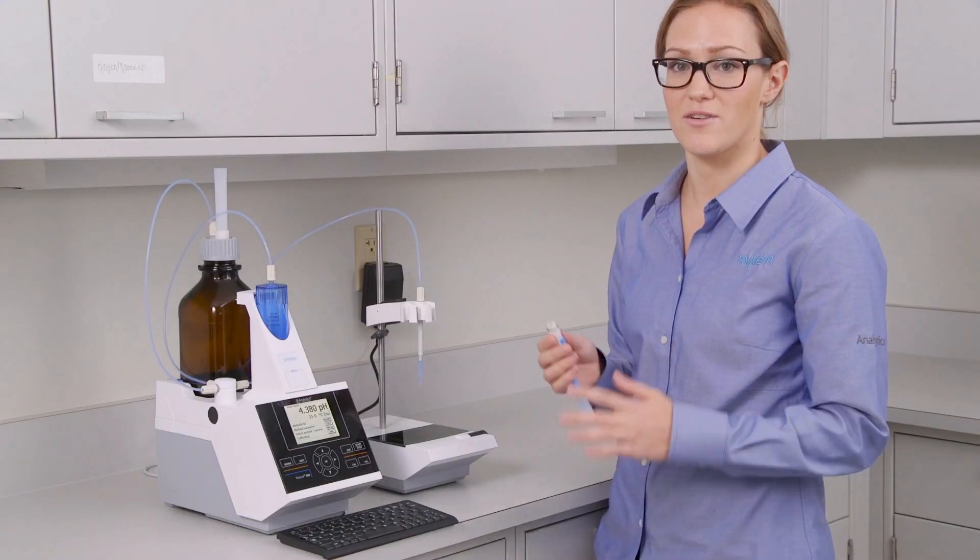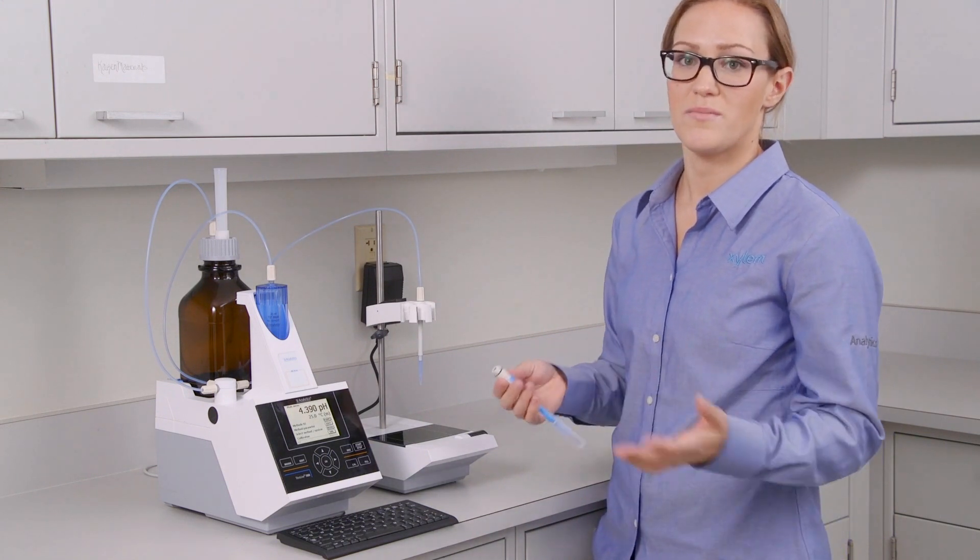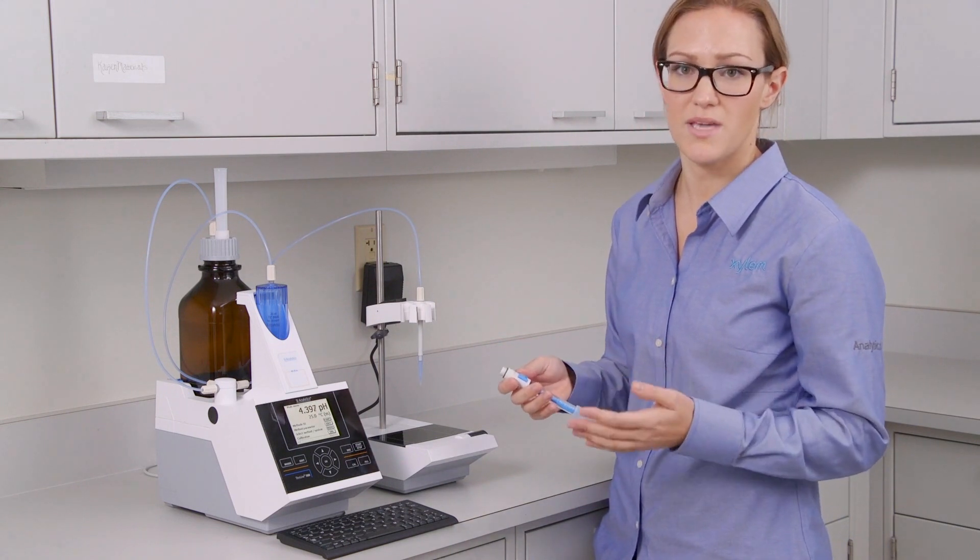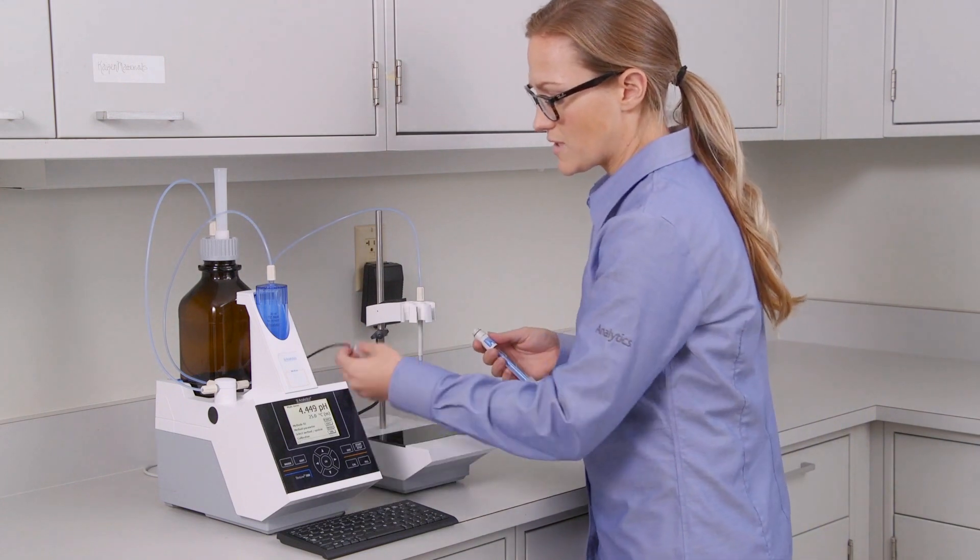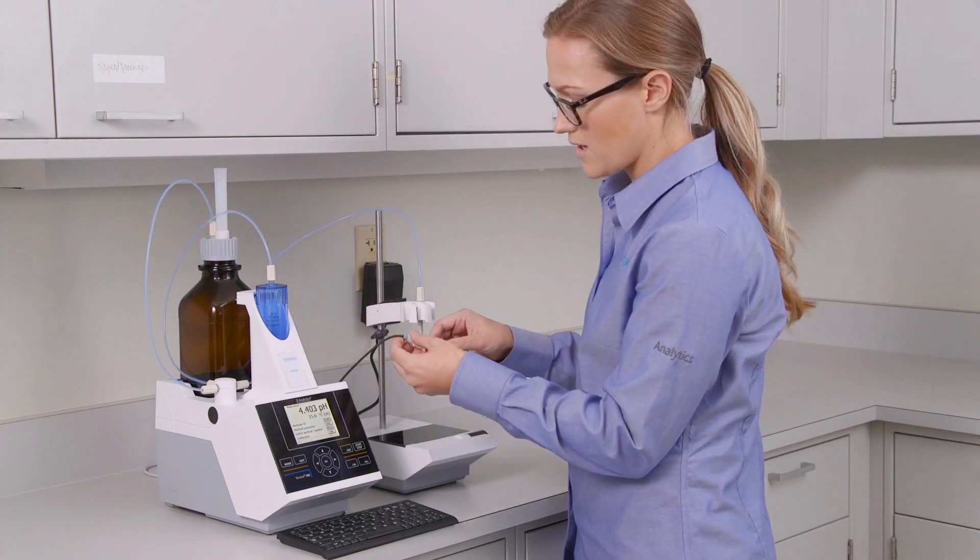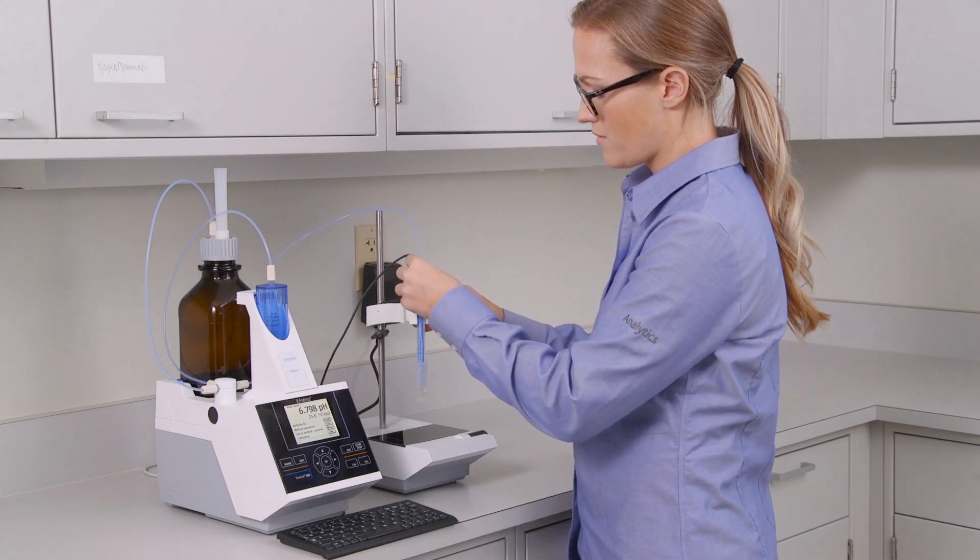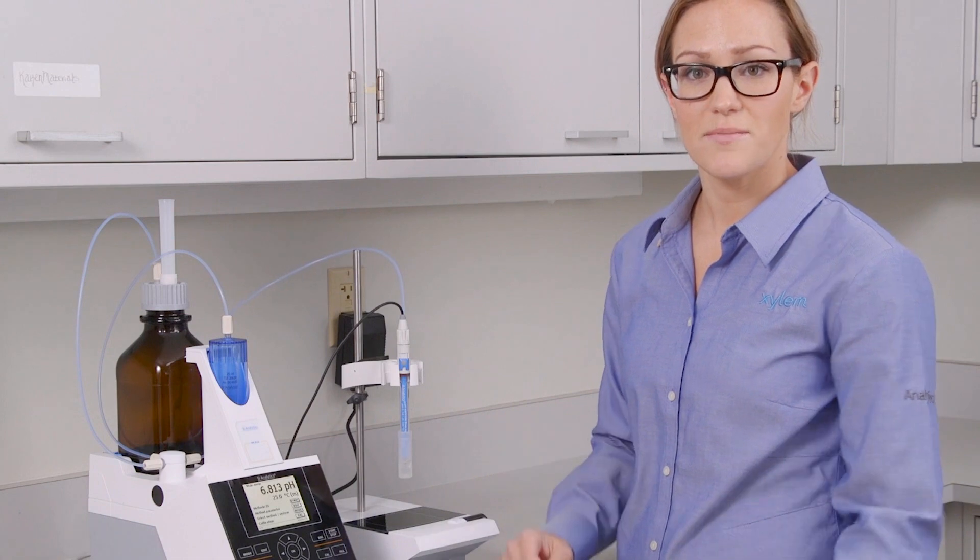The final step to getting your complete titrator set up is your electrode. Now you may be using a number of electrodes. In this case, we're just going to be working with a simple pH combination electrode. This is our blue line 11. So you'll take the other end of your electrode cable and just connect it to the top of your probe. And you'll take your probe and put it on top of the clamp like so. And it's as simple as that.